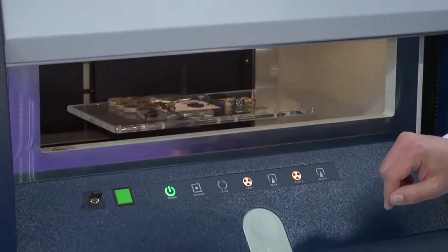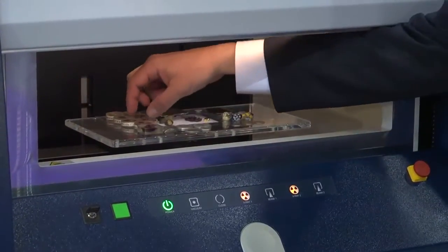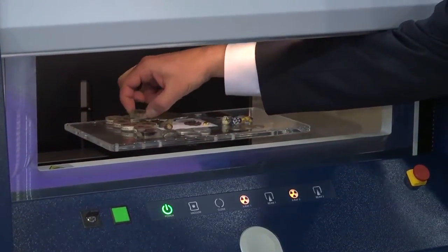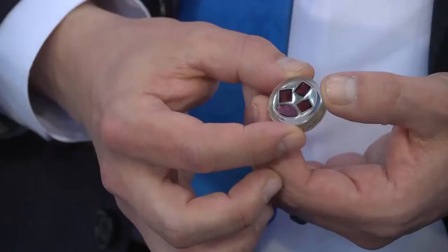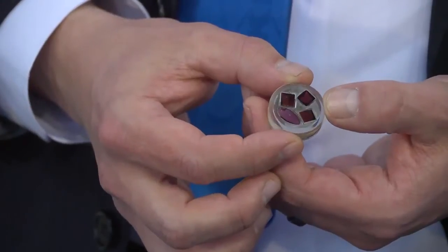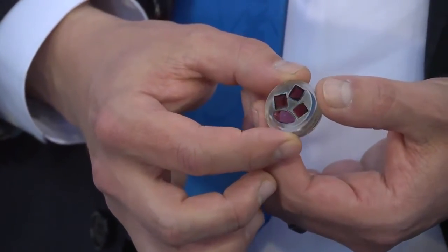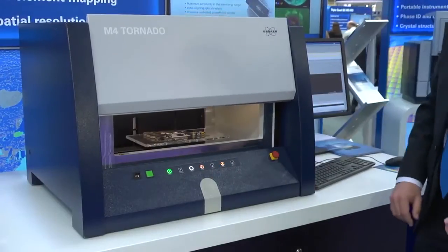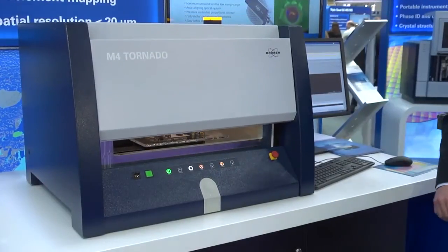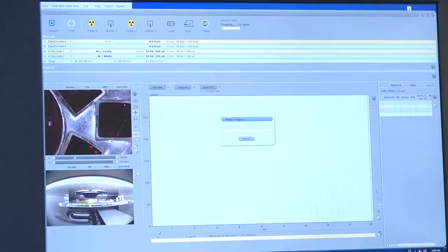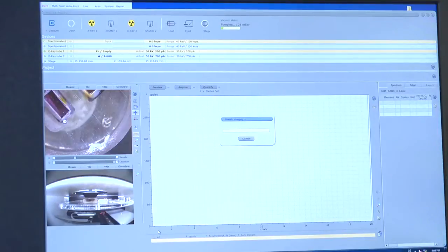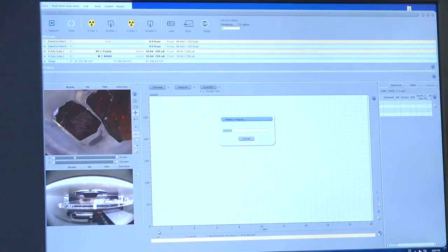One of the main features of the instrument was based on providing a chamber size and dimension that allows access to very large samples. The large chamber allows you to position samples up to 5 kilograms and 30 centimeters long. That is one of the key size points.